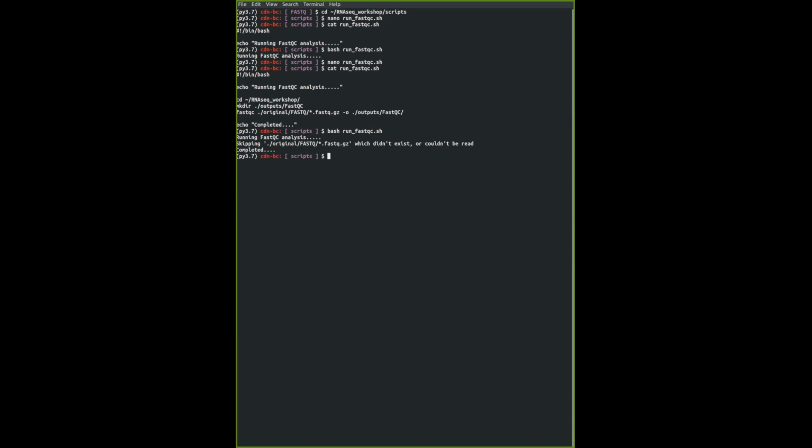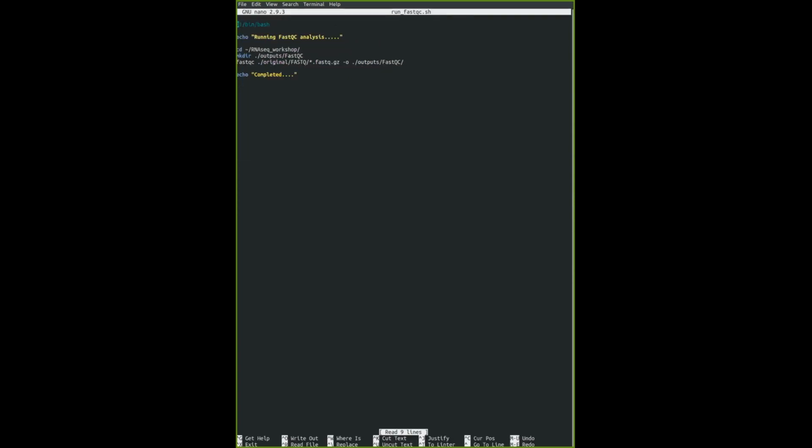Cool. See, this is where even I have problems. Let me see. So I have an error, or I know why. Okay, so I typed in the wrong name of the folder. It's not original, it's originals. My apologies for that. If you type in original with me, chances are that you also have the same error, and we all had the same error together, right? So save it, Control O, and then Control X, and let's try it again.